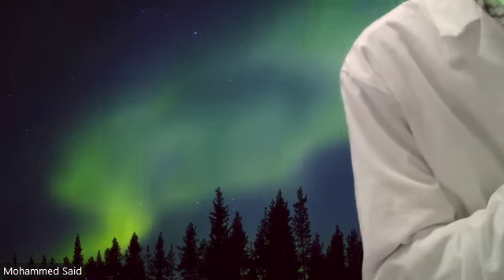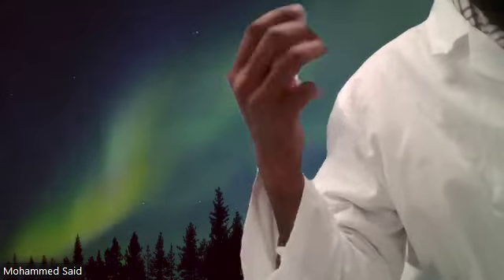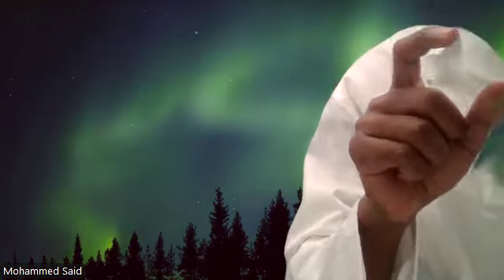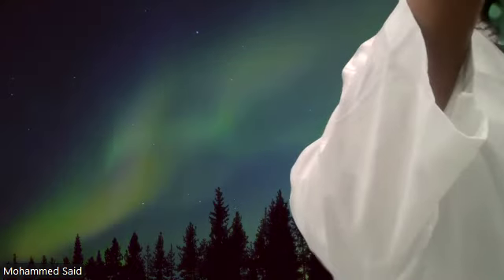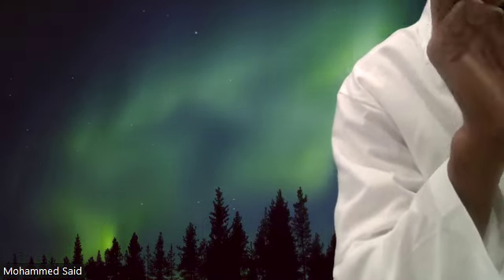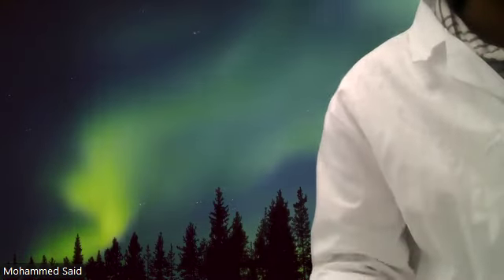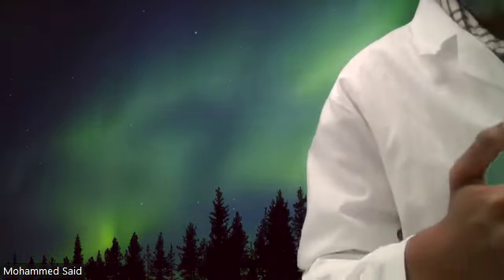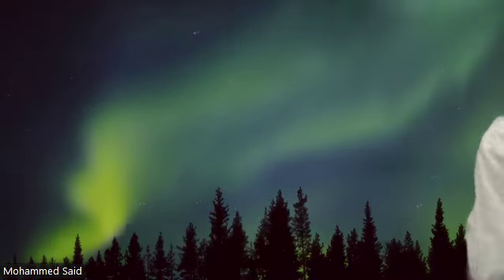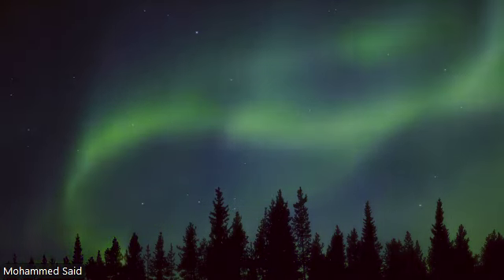Once you're done with the three tubes, at least for the NA slant and the motility test tube, please place them back in the middle and right rack respectively. The unknown tube that you had earlier, you're still going to use it for our gram stain and capsule staining today. So you can still make use of it. Just make sure that you don't forget your numbers. Make sure that you write it down. Yes. Thank you so much.